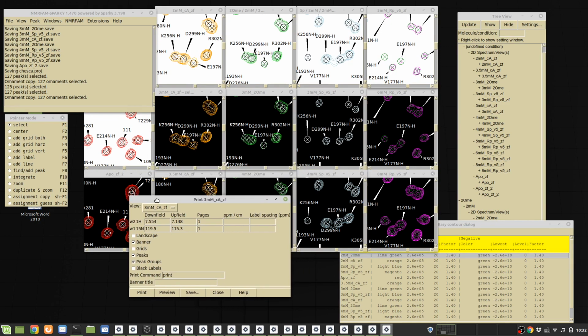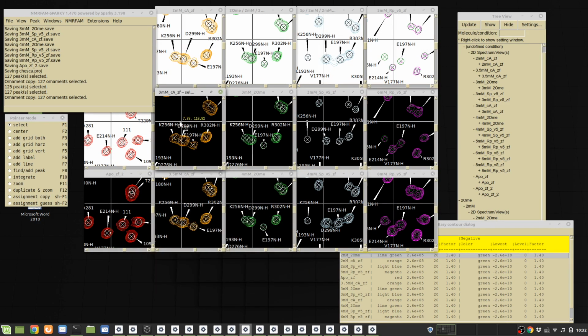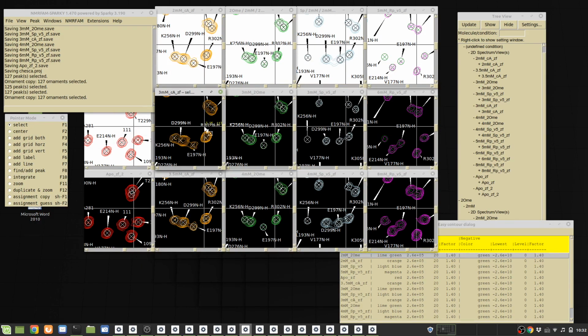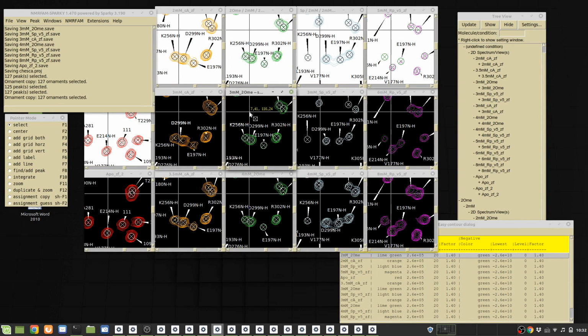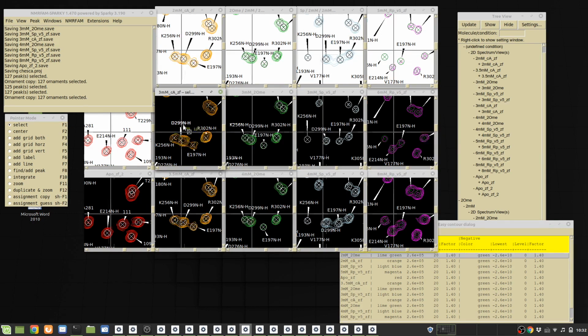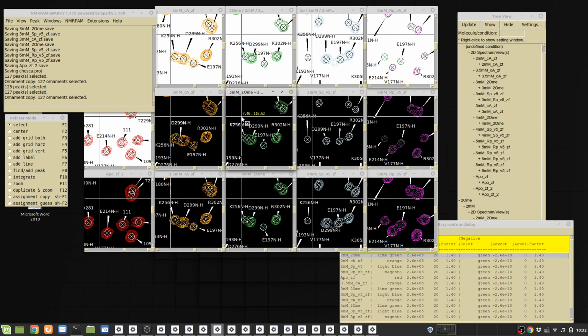It used to be PT, PT still works, and Ctrl P is the same hotkey as in other programs in general, so that works as print. So Ctrl A, Ctrl C, and then move to the other and Ctrl V will work like other general software packages. That may be helpful, and easy to understand how that works.